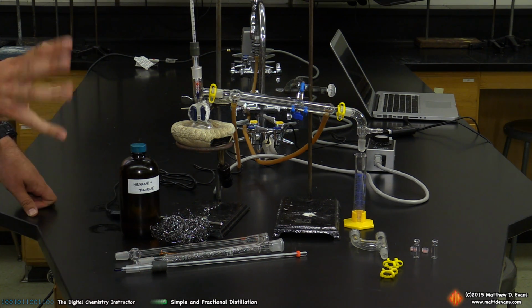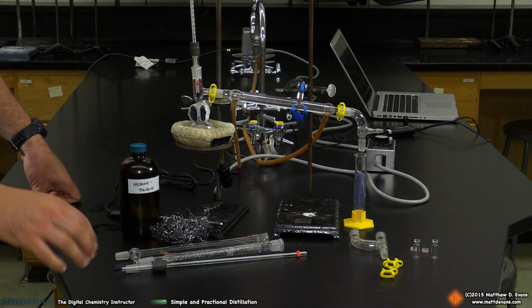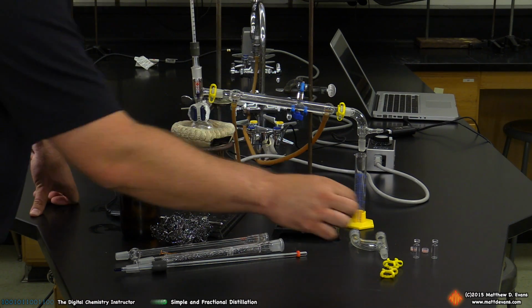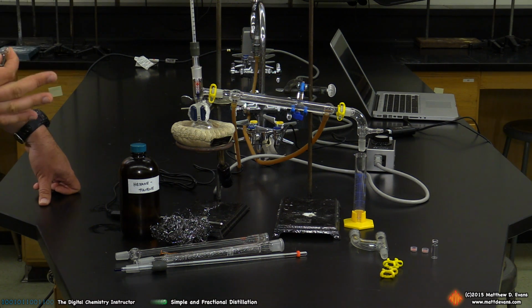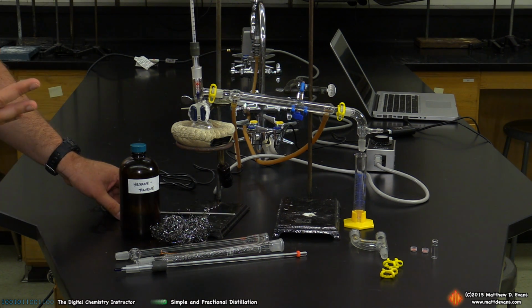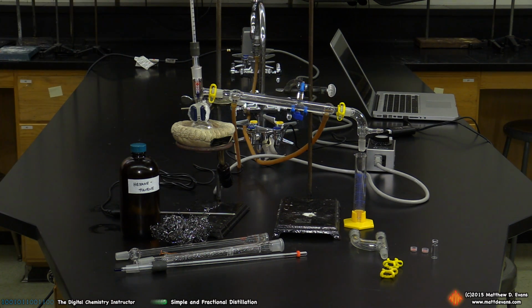Now the procedure, once you get going and start heating this, we're going to gradually collect distillate. You're probably going to get a total of about 20 milliliters of distillate, maybe a little bit more, maybe a little bit less. You're watching this the whole time, you're watching the temperature. Every time you reach 1 milliliter of distillate collected, you've got to take the temperature. On the digital version, that's pretty simple. On the analog version, you've got to remember to do that. Every milliliter that you collect, you've got to read the temperature in Celsius.